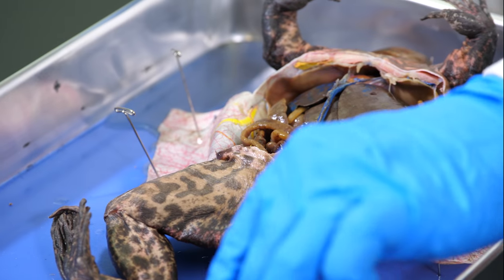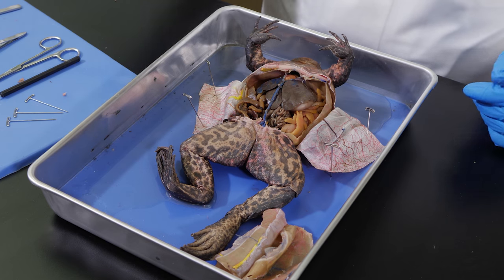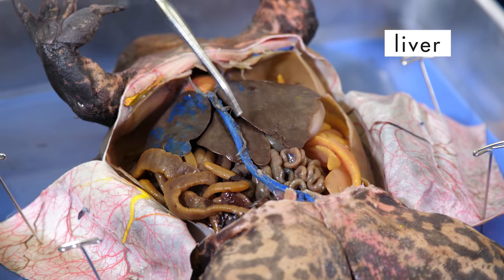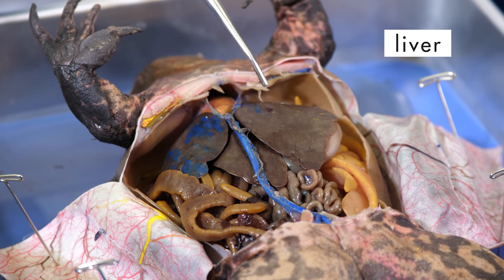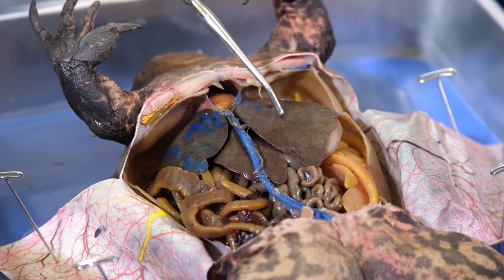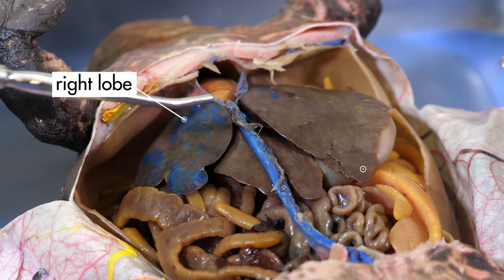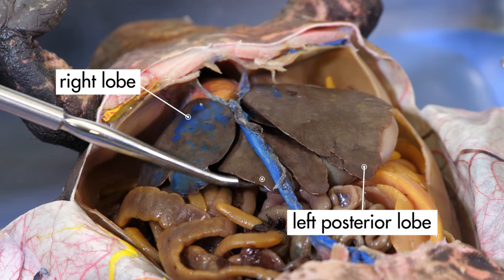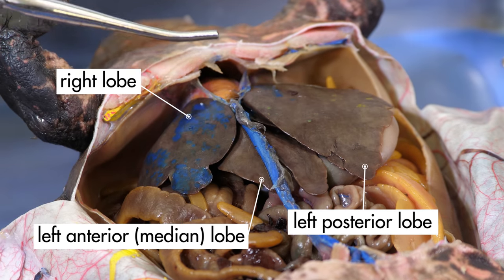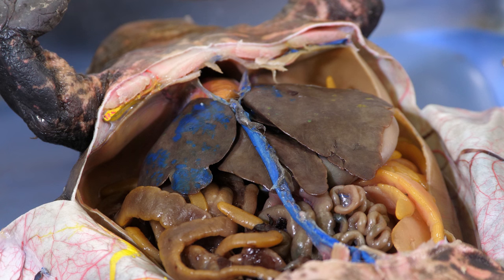We should be able to see many of the internal organs now. One of the most prominent internal organs of the frog is its liver, which is this large, flat, brown organ. Notice that the frog's liver has three parts called lobes: the right lobe, the left posterior lobe, and the left anterior lobe, which is sometimes called the median lobe. The frog's liver, like our liver, produces many hormones and enzymes, including bile, which is necessary for digestion.